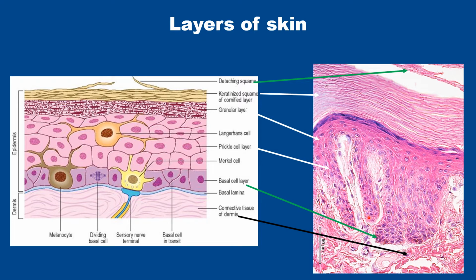So at the base of the dermal papilla, one can see the stratum basal cells, and from these cells only the other layers develop. You can see sometimes mitotic figures. What are the other cells present in the stratum basal?